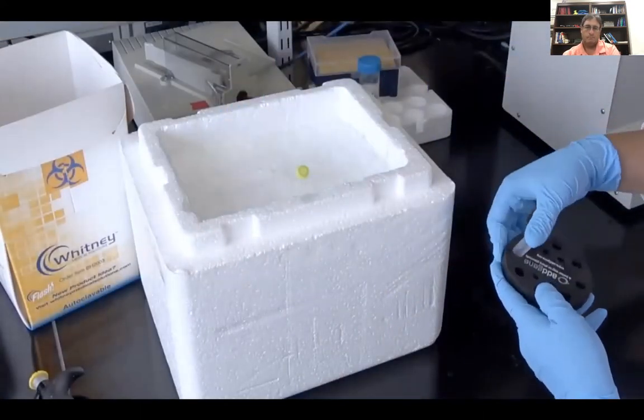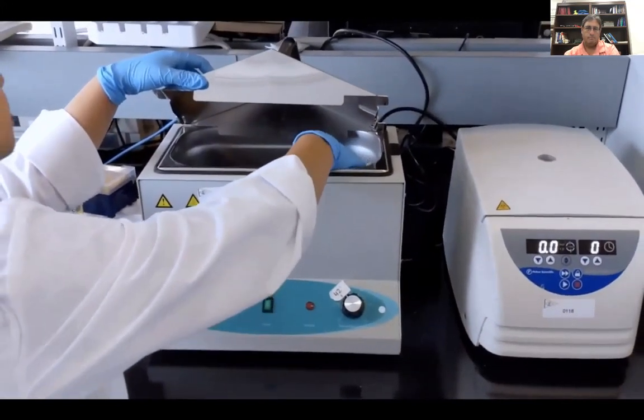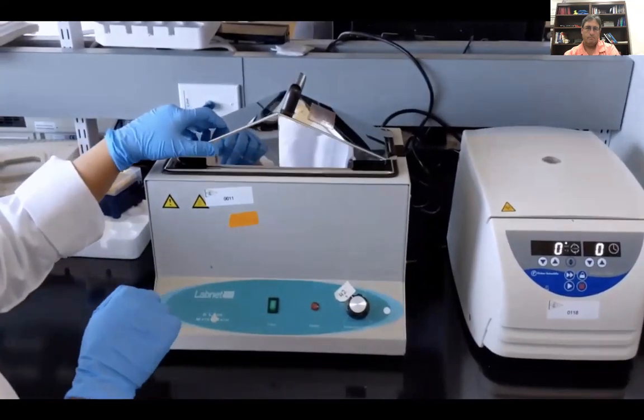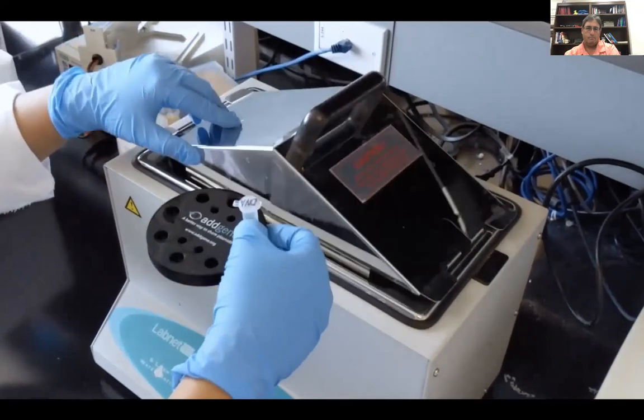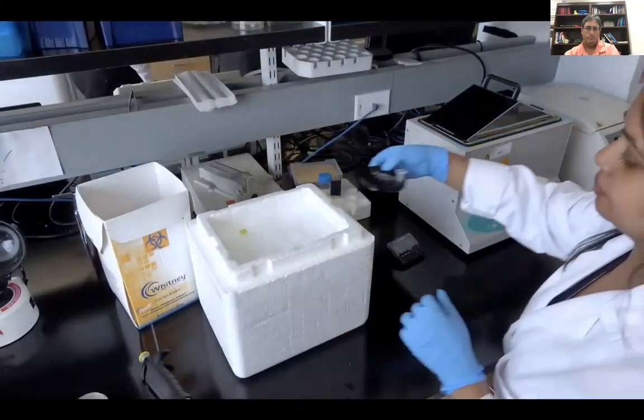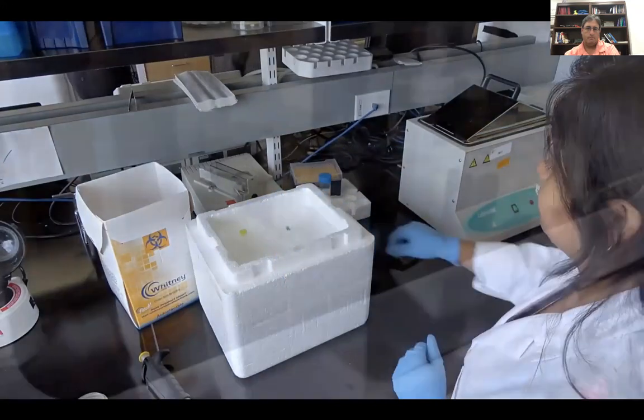Next, heat shock the DNA competent cell mixture by placing the tube in a floating rack inside a 42 degrees Celsius water bath for 45 seconds. Then place the tube on ice for 2 minutes. This change in temperature increases the permeability of the bacterial cell membrane and allows the plasmid to enter the cells.